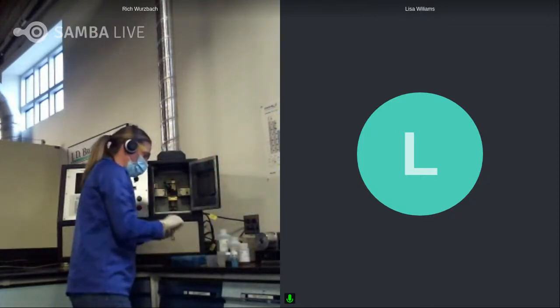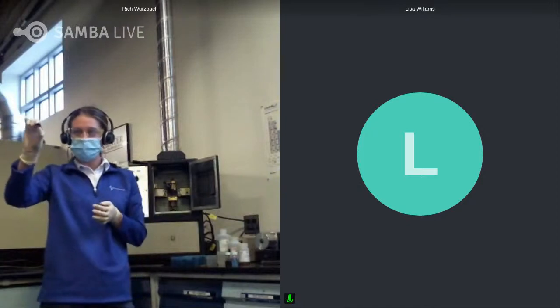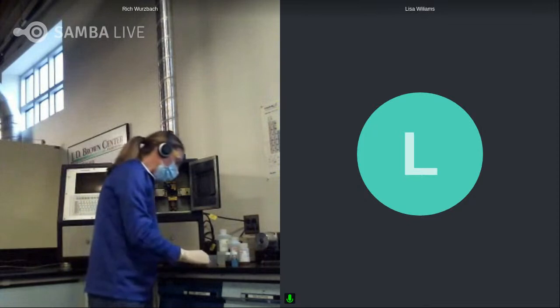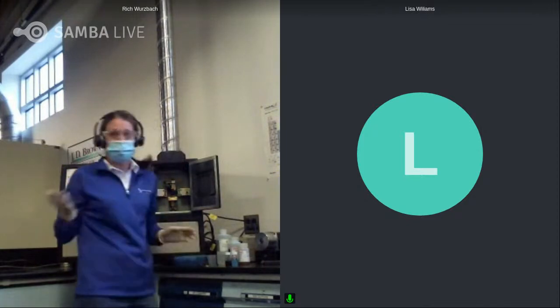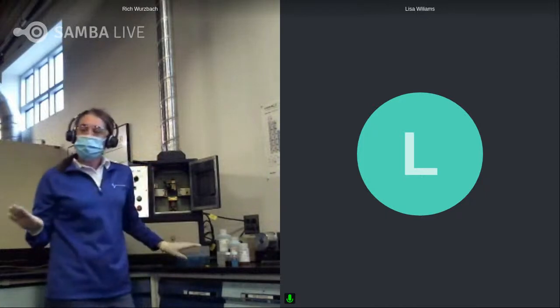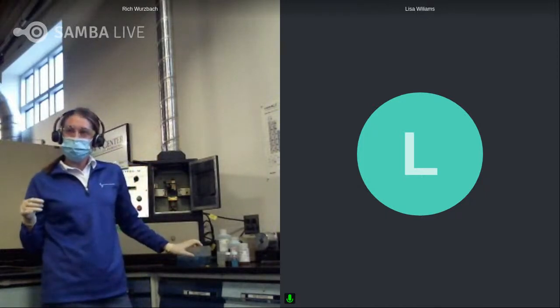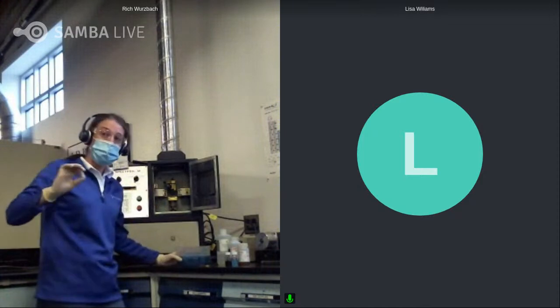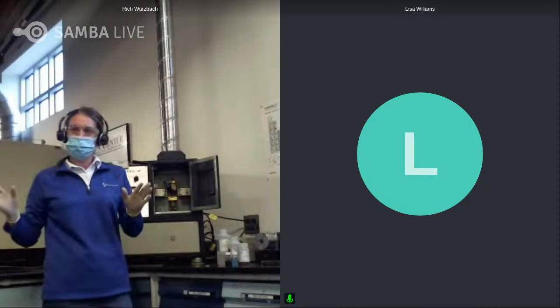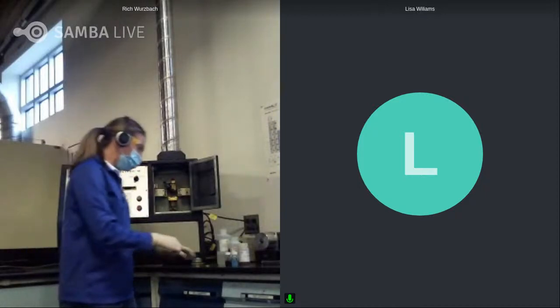So the RDE sample cup. This is just a black cup. Spectro Scientific sells these. It's a consumable for the instrument. This black cup is what you're going to use for your oil samples, and you're going to use it for your grease samples too. If you're worried about the black cup burning up, don't worry. It will melt a little bit, but it will not burn up, okay? It's nice because it's just a disposable thing and you can just throw it away.